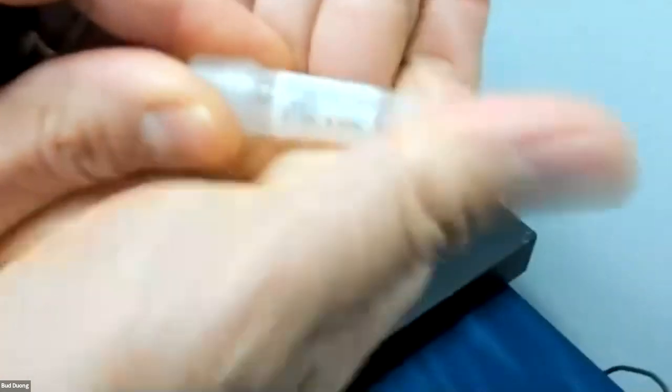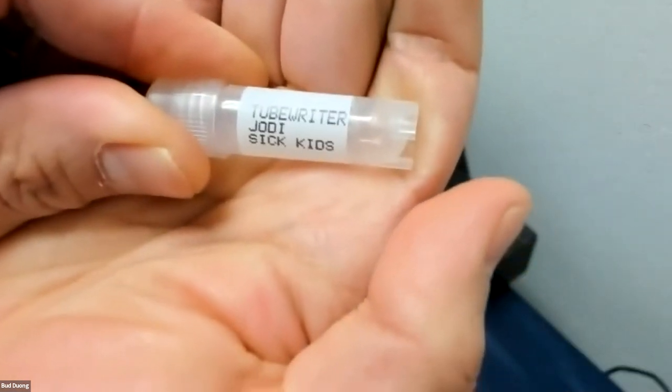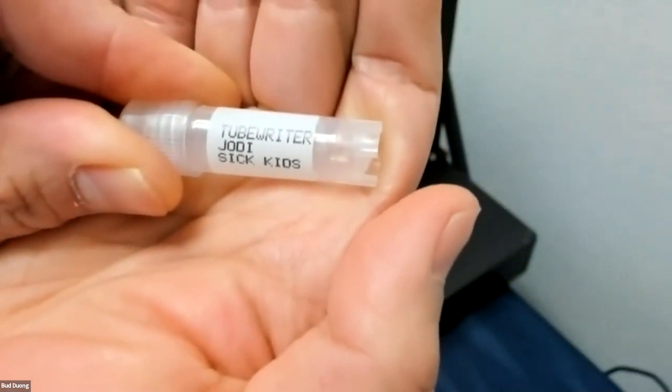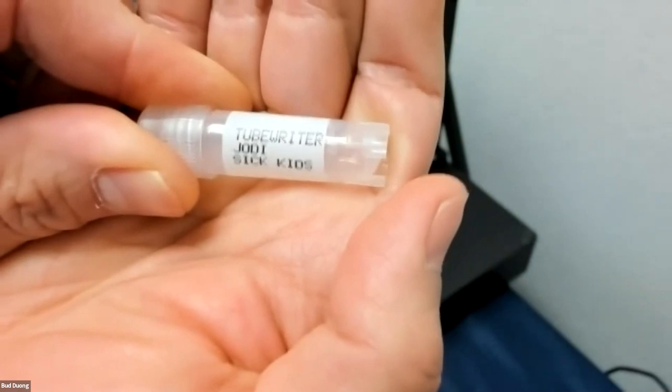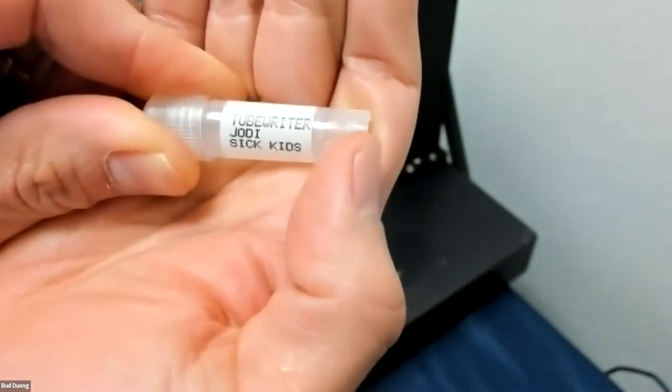As you can see, the ink dries instantly to the touch. For full alcohol resistance to kick in takes about 30 to 45 minutes, but for normal handling — and oftentimes even if you're using 70% alcohol — it's totally fine.